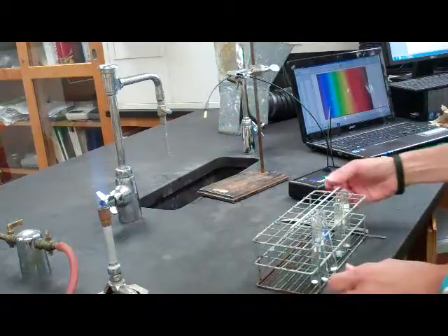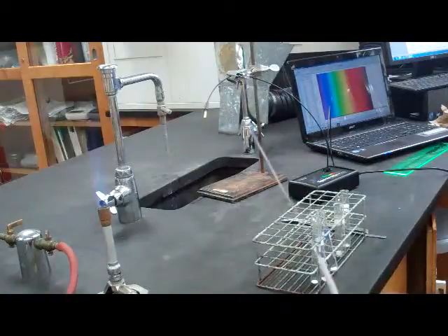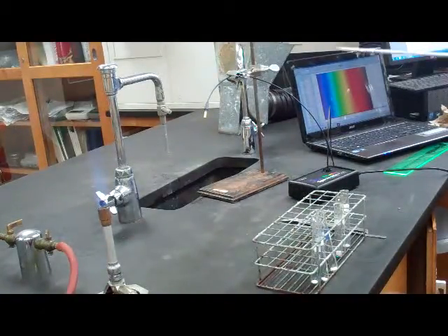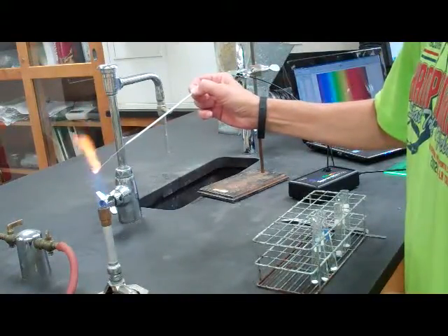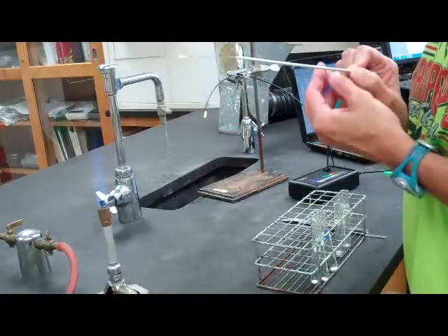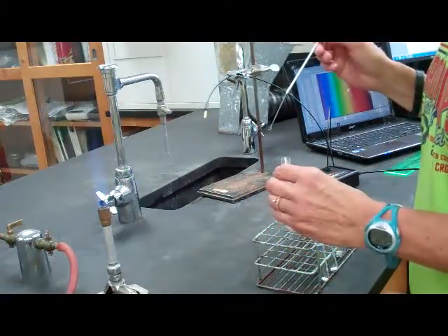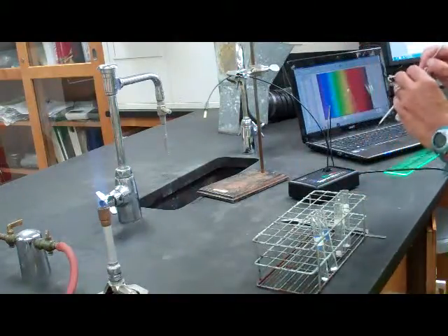Then what we're asked to do is to use our loop. This is our nichrome loop. What we're asked to do first, in the blue part of the flame, is make sure there are no contaminants. So hold it in the flame until it burns. Now, mine's brand new, so I know it's clean. I'm starting first with the lithium.